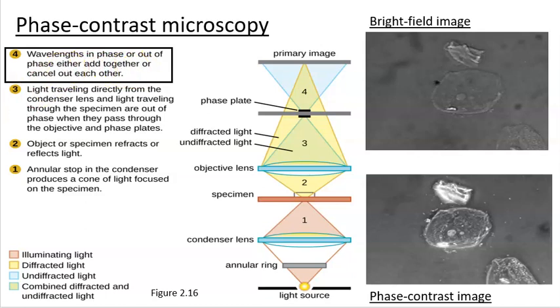And so your specimen is going to be refracting some of the light and changing the phase of that to increase your contrast. So again, it's your standard light microscope, adding in a couple of extra pieces here. Your standard bright field microscope, you're looking at maybe $1,000, maybe $100 for a dark field stuff. With phase contrast, you're looking at $2,000 to $5,000 for those microscopes, depending on how much you want to go in for really, really good optics on that.